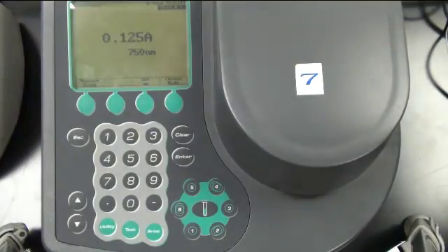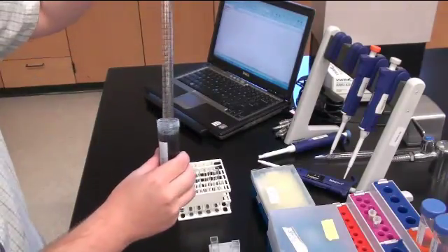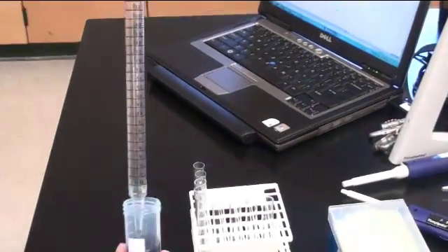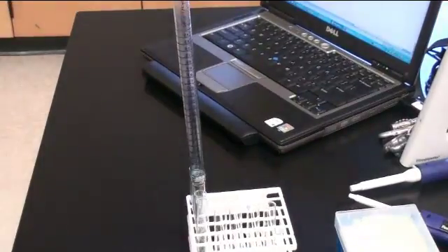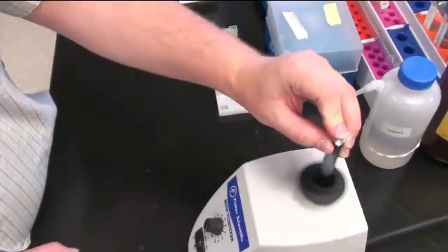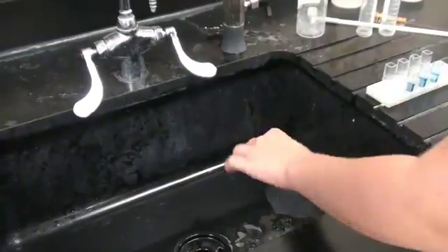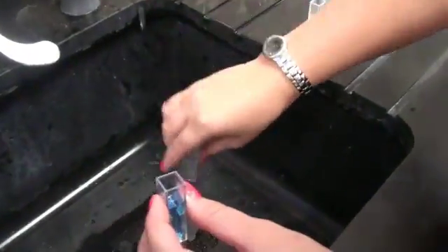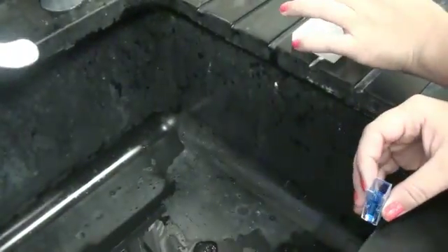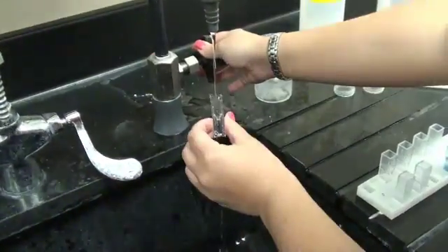For the Bradford assay, you follow pretty much the same steps. However, instead of adding reagents A and B, you will add your Bradford reagent — 5 milliliters of Bradford reagent added to each test tube — and then gently vortex. You wait 5 minutes for color development. During that time, you can also transfer 1000 microliters of each sample into a cuvette and change the absorbance on the spectrophotometer to 595 nanometers. After you have gotten your readings, rinse your cuvettes with water, and then rinse them again with methanol. Place some methanol in a cuvette and transfer it into each additional cuvette until each has been rinsed. Then rinse them again and dry them so they are ready for your next lab.